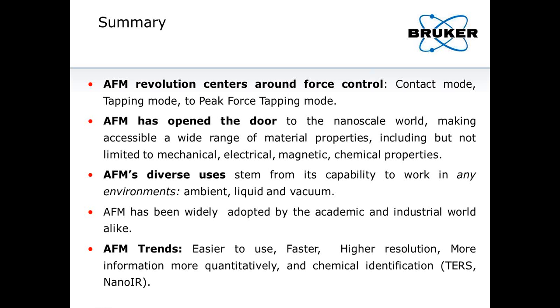A question regarding some of the electrical data you showed. It says scanning topography; I assume this may be scanning capacitance. Can it be used to measure the doping level and the type of semiconductor? Can you apply that to small features, like nanowires with 30 to 50 nanometer diameters? Could you use scanning capacitance there or scanning spreading resistance? For those, I would say yes.